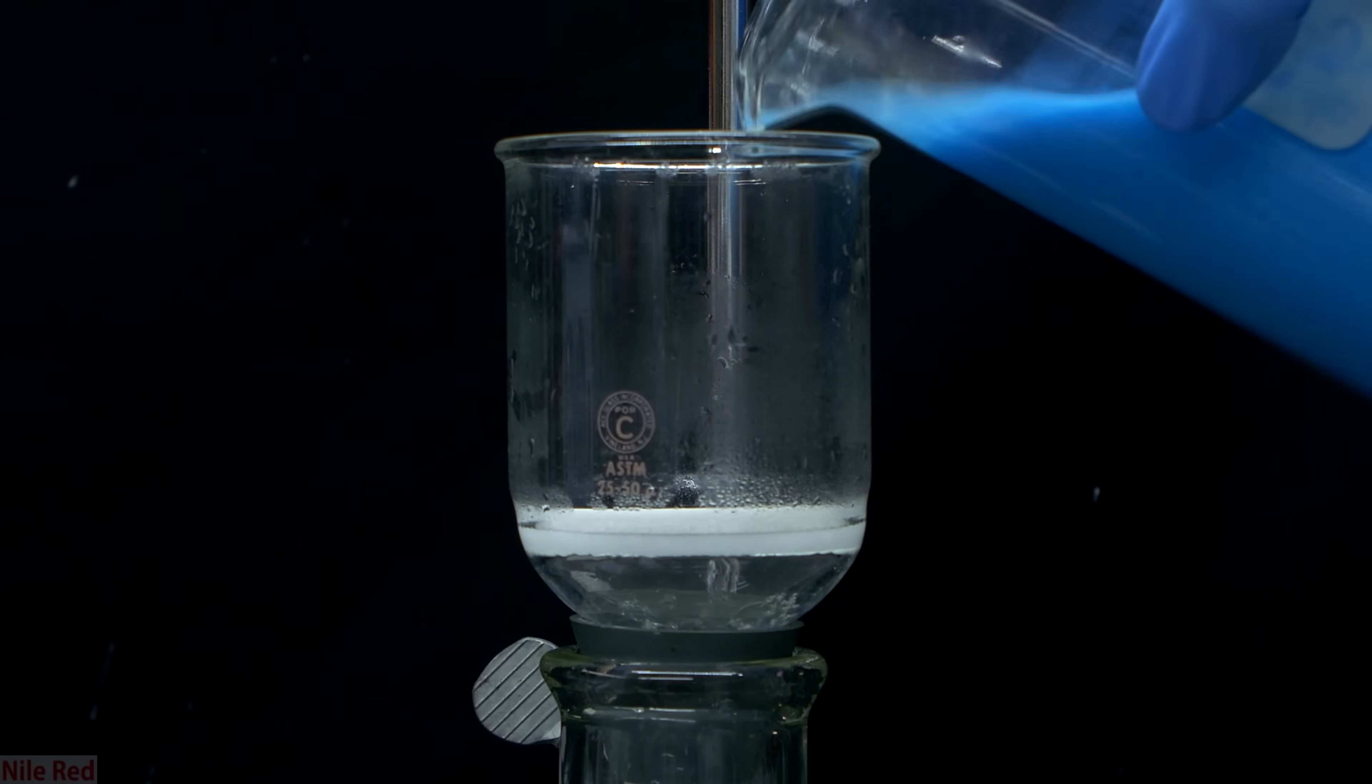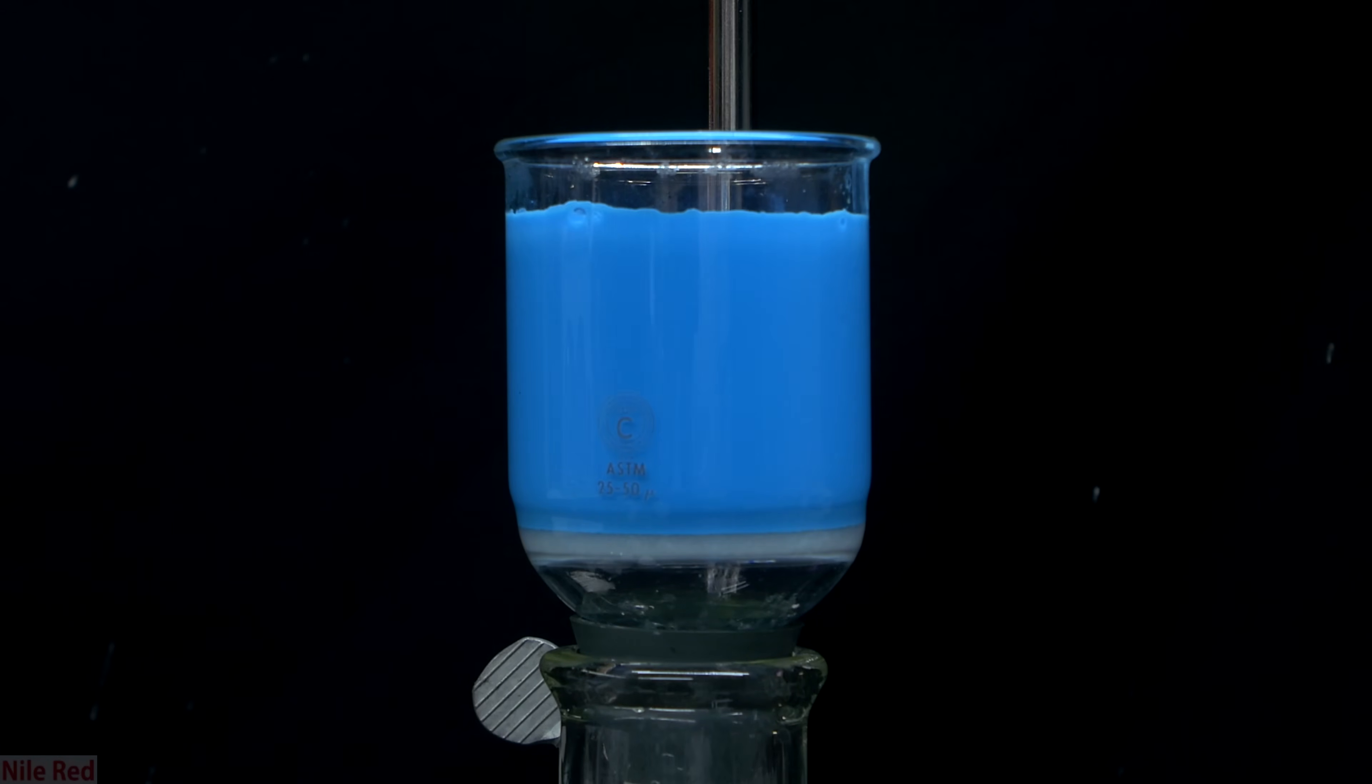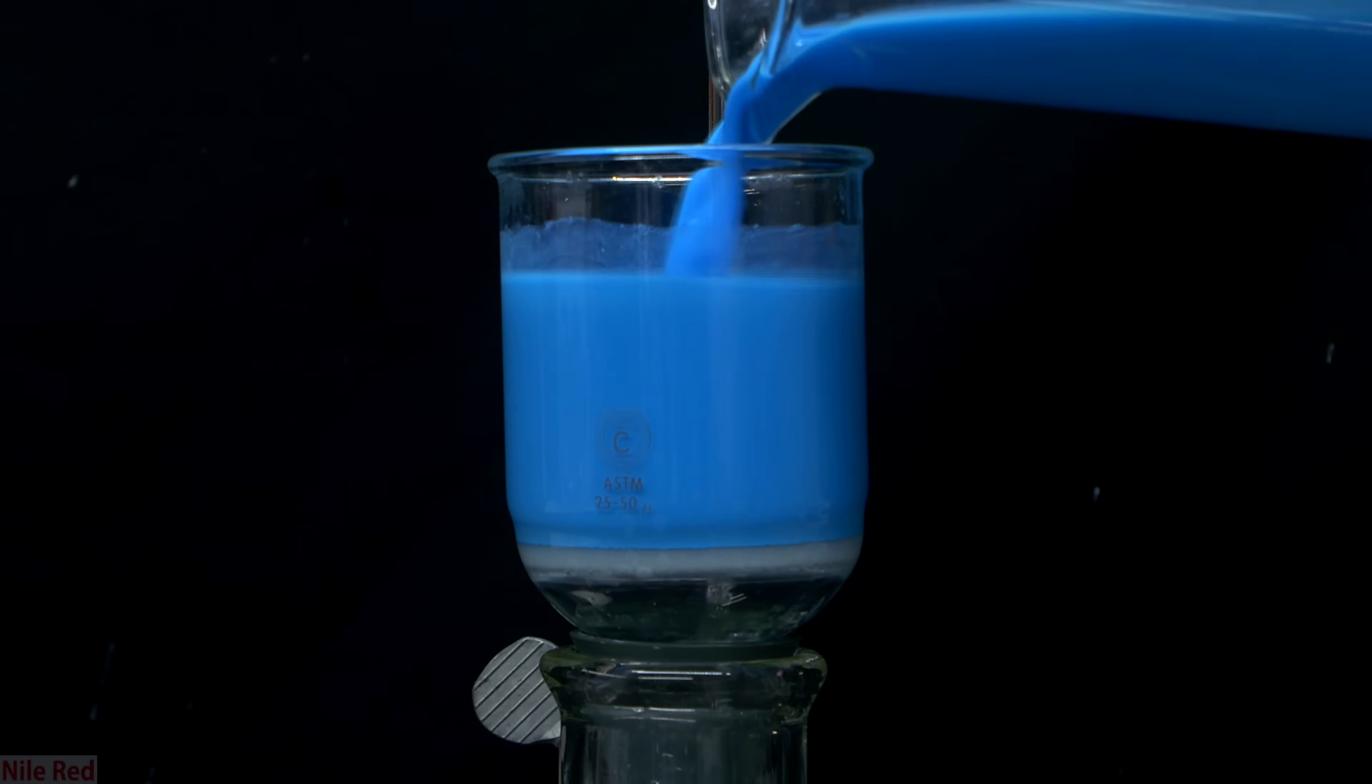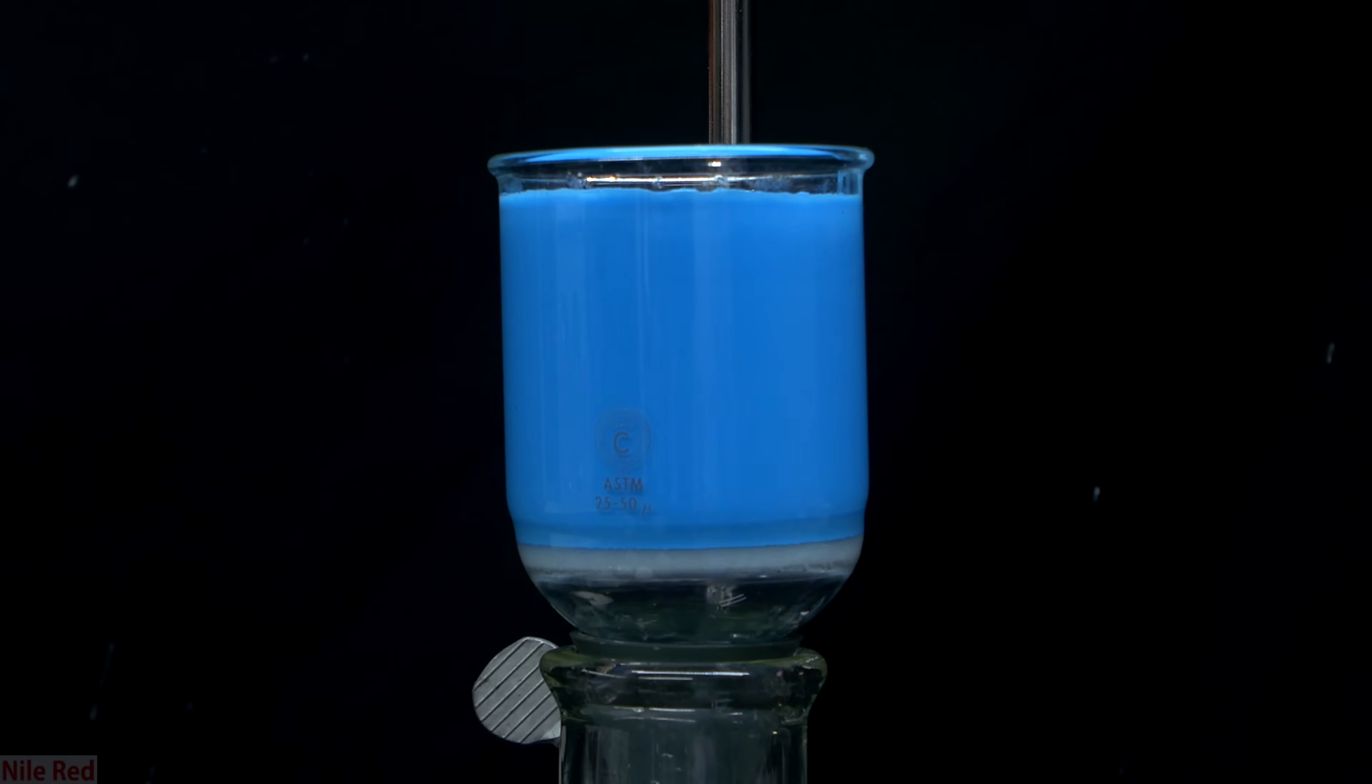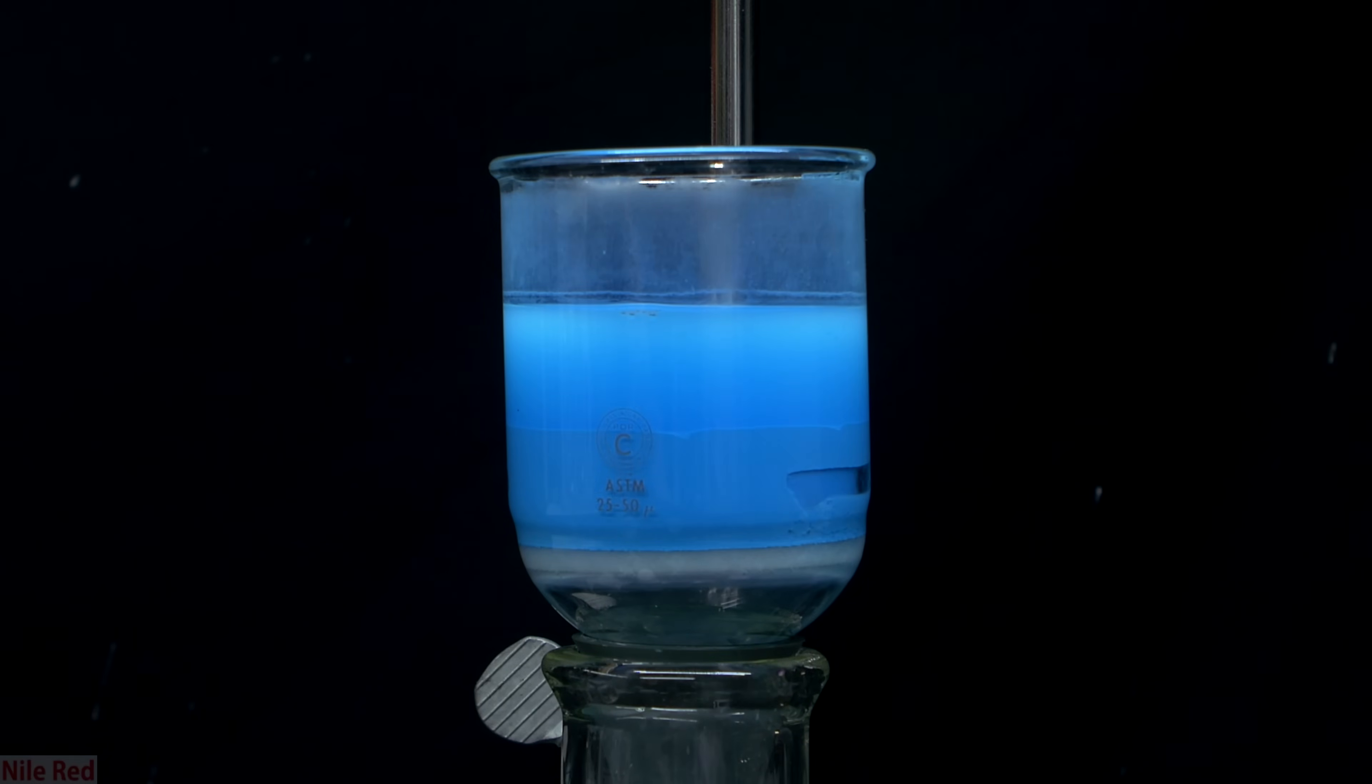For this I used a vacuum filtration setup, but in theory, you could do a gravity filtration as well. The process here is pretty simple, and I just transferred everything to the flask, pull a vacuum, and remove pretty much all of the water. Once all the water had been removed, more water was added to wash the copper hydroxide, and this process was repeated a few times.